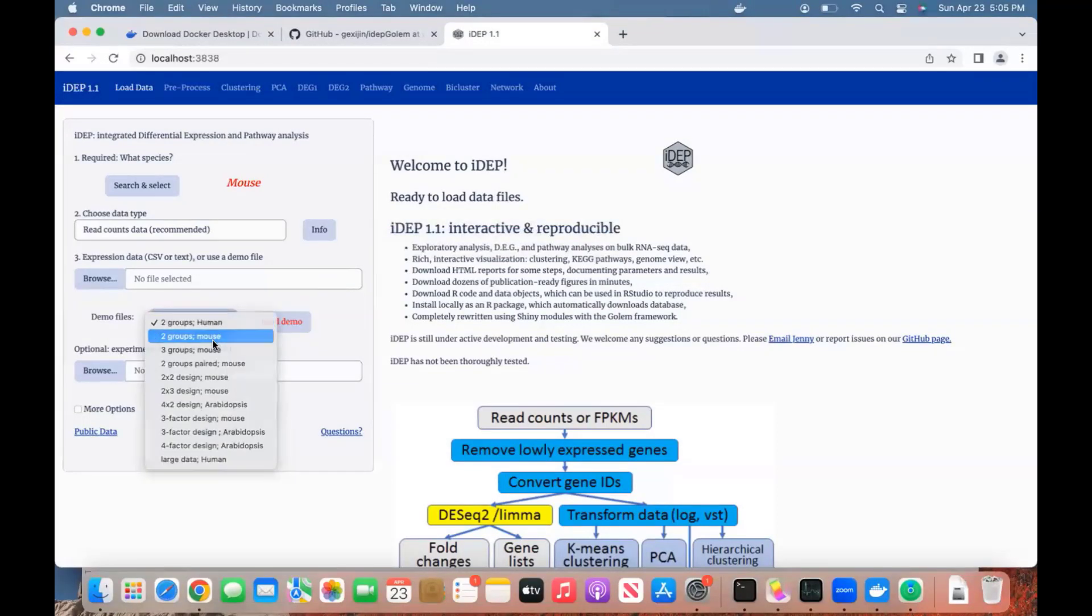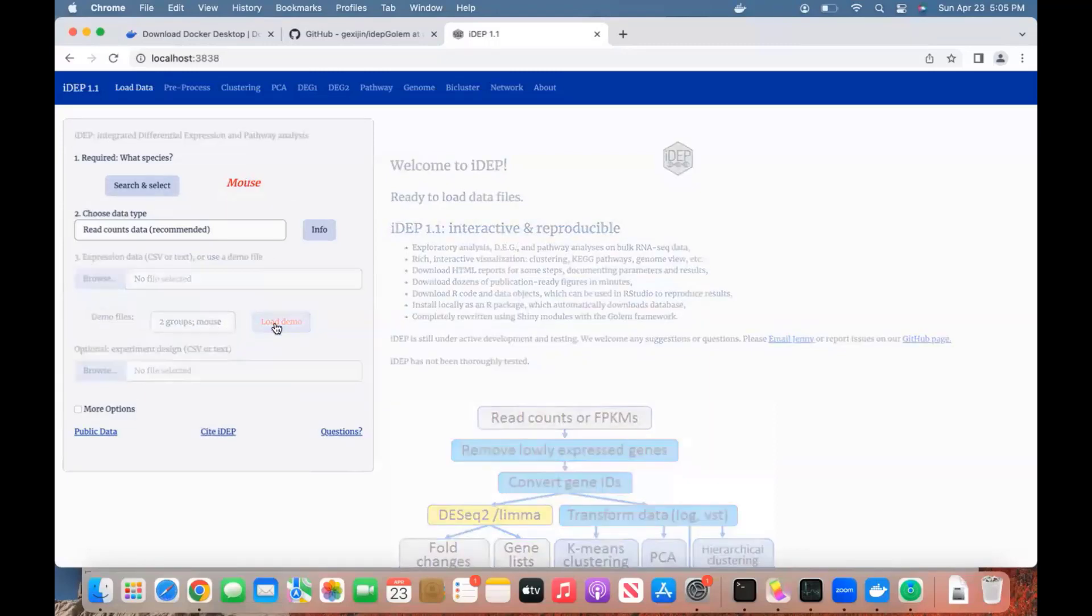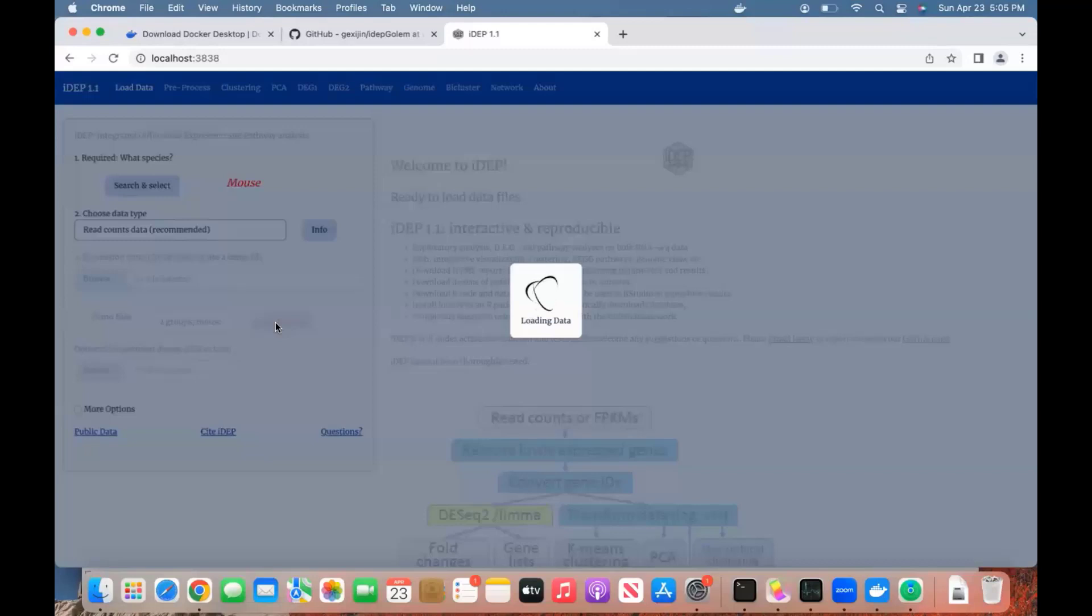I can select the mouse here, corresponding to this organism. Load the demo data, and there you go. You can analyze it from here. So this is one method, running from the browser.